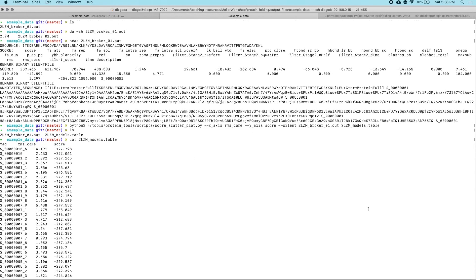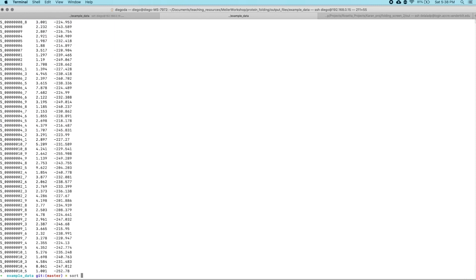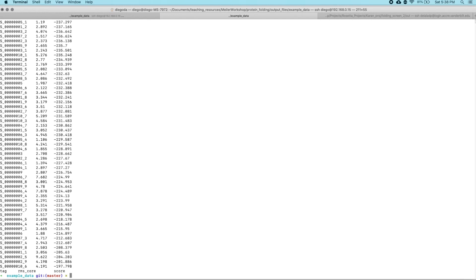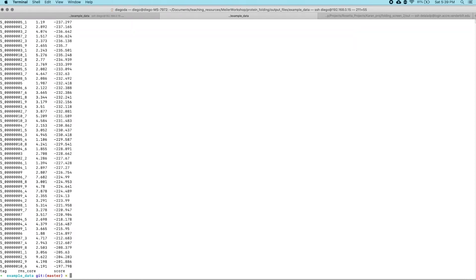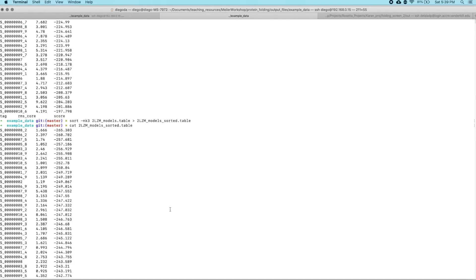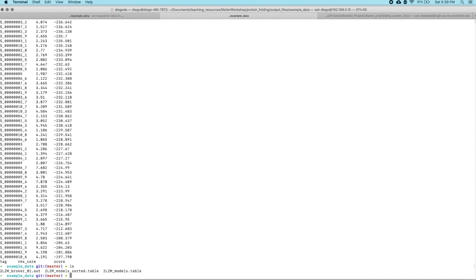Now to make our lives easier, we can just go ahead and sort this using the sort command. If you just hit enter, it'll output the contents of the sorted file, but it won't actually save it. So to save it, we'll just go ahead and redirect the output. And now when we cat this, we'll see that the third column — the score — has been sorted from lowest to highest. Now we're interested in the top scoring model, but it's trapped somewhere in this large file. So how do we get it out and into a format that is useful for a human being?